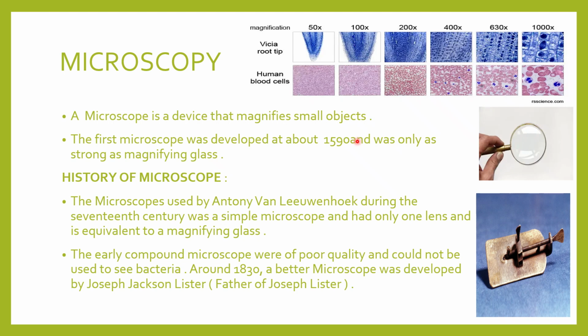As we all know, a microscope is a device which is used to enlarge or magnify small objects, and with the help of a microscope we can also see objects or organisms which we cannot see with our naked eyes.